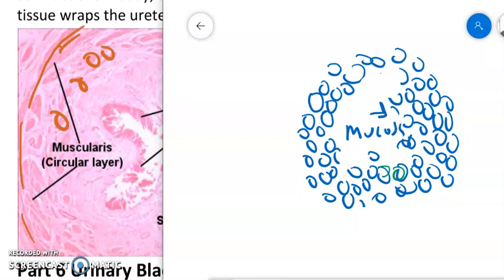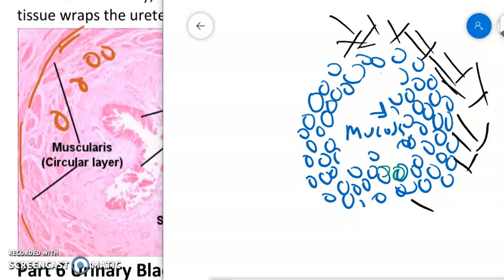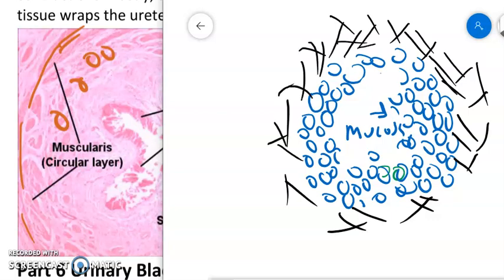The next one is the lamina propria, and this is usually attached to the submucosa of other tissues. You don't have a true submucosa. So let's do this here. Ta-da! There's your lamina propria. So, our next layer is our muscularis. Now there's two layers to this muscularis. They're both thin. The first is a longitudinal. So they're going to be going north-south, just like our tube is going north-south.